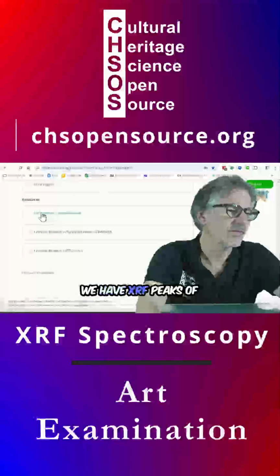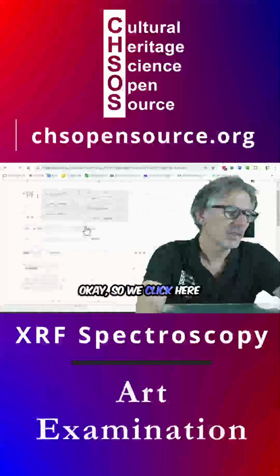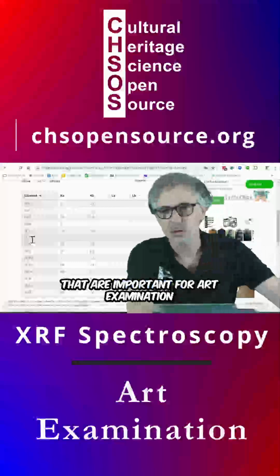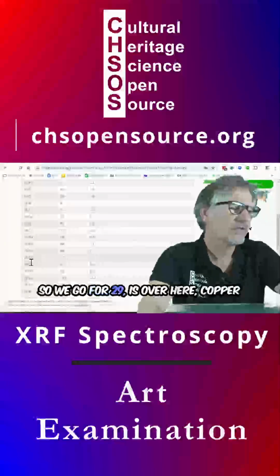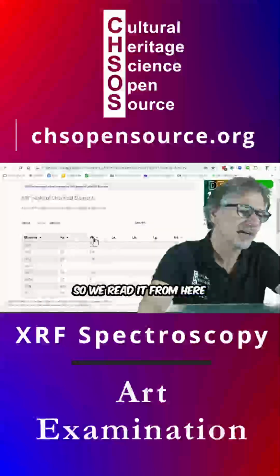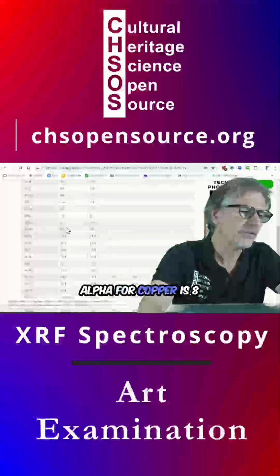We have XRF peaks of chemical elements. We click here, and here we have the main elements that are important for art examination. So we go for 29, copper. We read K alpha and K beta. K alpha for copper is 8 and K beta is 8.9.